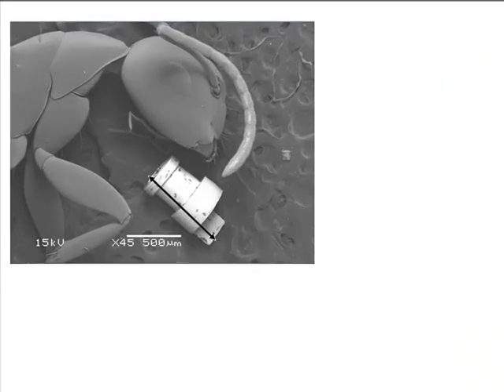I'm going to demonstrate how to determine the size of a feature in a micrograph using the scale bar in a micrograph.